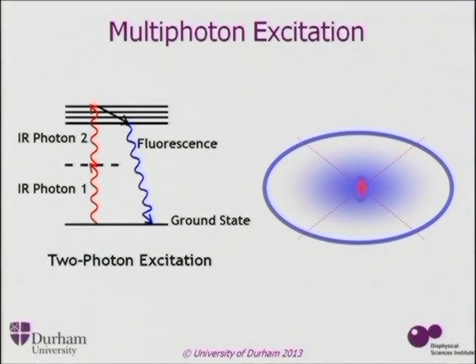So the other technique, as was mentioned yesterday in answer to one of the questions, is multiphoton excitation. What we're typically doing in the case of fluorescence is we have a fluorophore that, let's say, needs blue light to excite it. So we put 2 photons of roughly twice the wavelength, half the energy, into the sample, and they can be absorbed simultaneously, and then produce blue fluorescence, or the longer wavelength fluorescence normally coming out. But the chance of this happening, of infrared light producing blue fluorescence, is very, very low, and it only happens right at the focus.